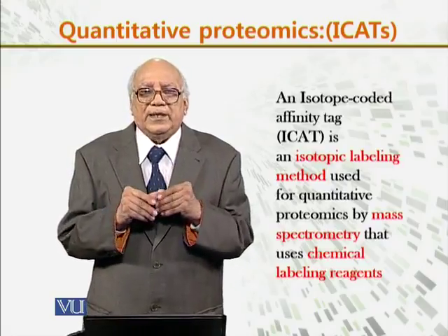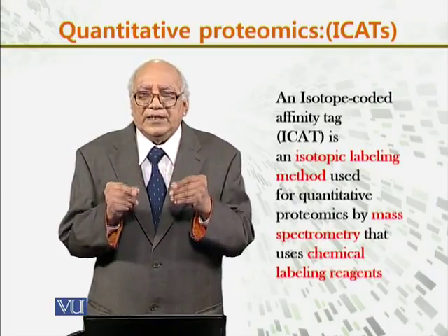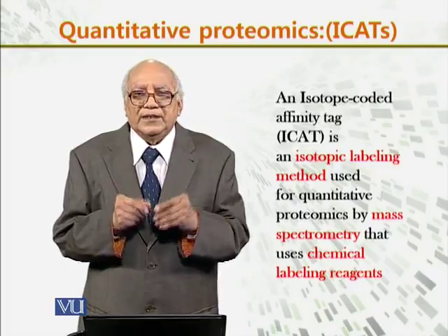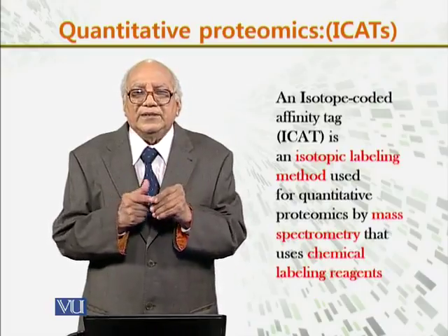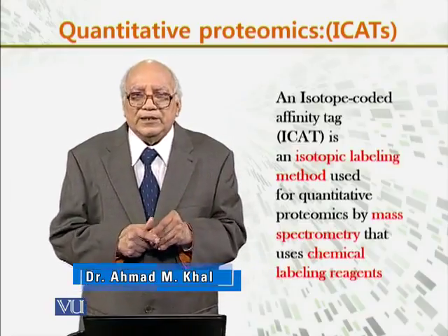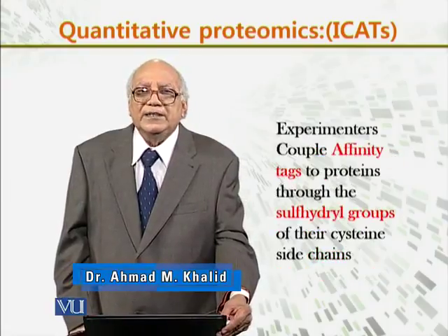You see, in this method, the tags are chemical reagents, and they tag the different peptides and protein molecules and allow us to quantify those molecules.